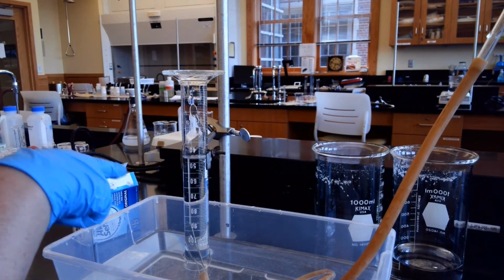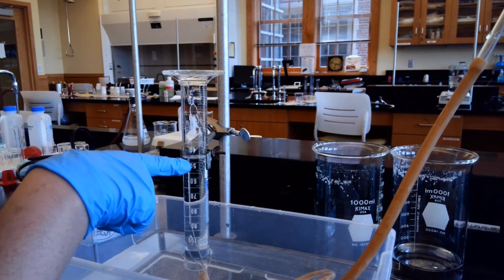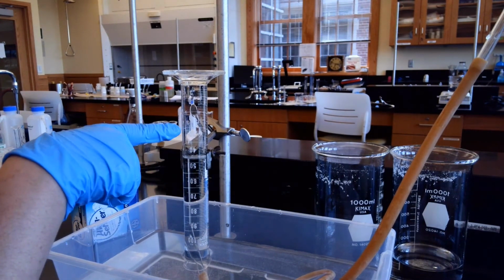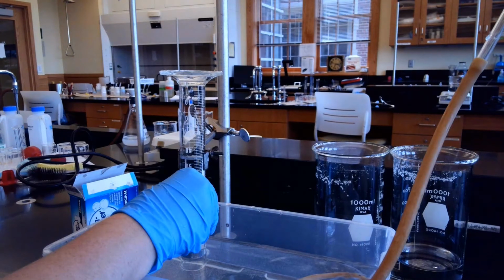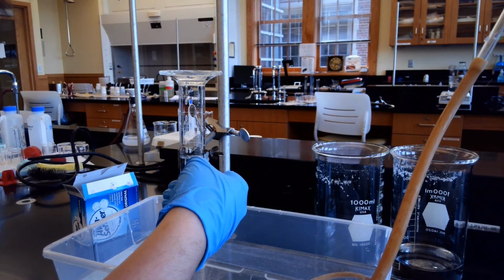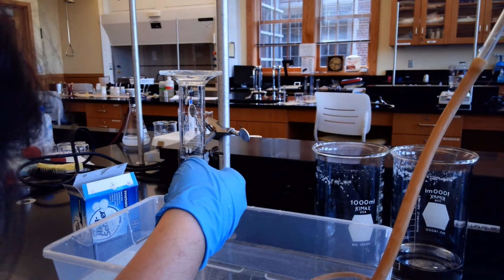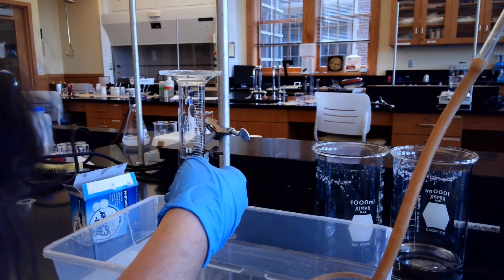If we're looking at the graduated cylinder here, this is 50. So here would be the 10, 20, 30, 40. Again, we had 50. So this would be 49. And this would be 48. And this would be 47.